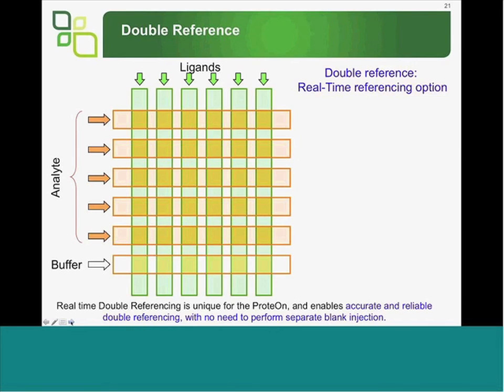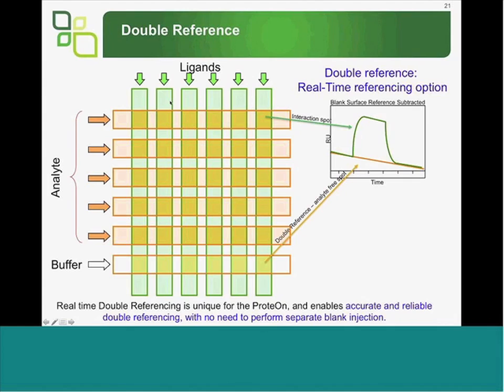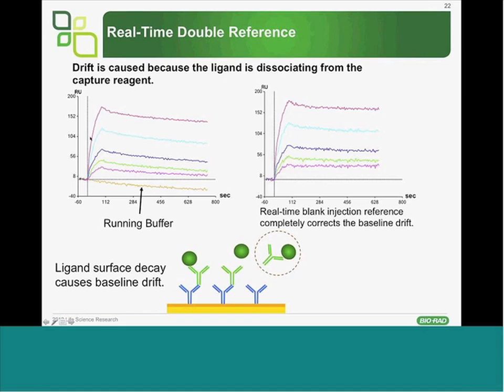What you see here is that if we have a problem, because let's say we immobilized our ligand and our ligand has a drift, so the whole instrument has a drift, which happens, and this could happen because the ligand is cleaved slowly, or for other reasons, but this is something that definitely can happen. So now our double referencing also has the same kind of drift in it when we run the buffer and not a specific analyte. So in double referencing, we will remove this kind of drift and problems, and we get the net signal, and you can see it in the next slide in reality. So you see here, this is the run, and this here is the empty run, and now after using the buffer channel here, we correct the drift problem that you have seen before, and now you get a very nice curve that is much easier for fitting after the double referencing.